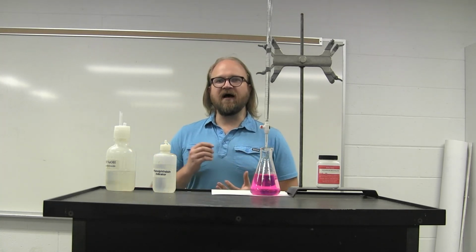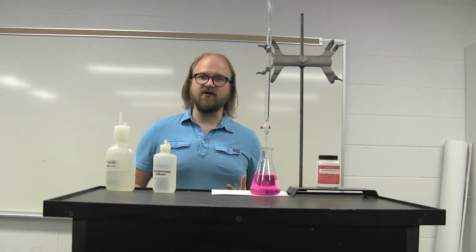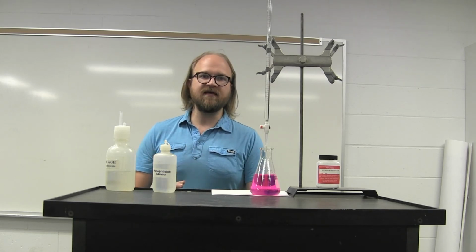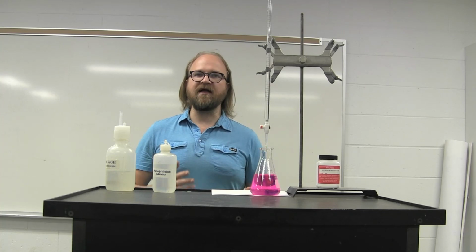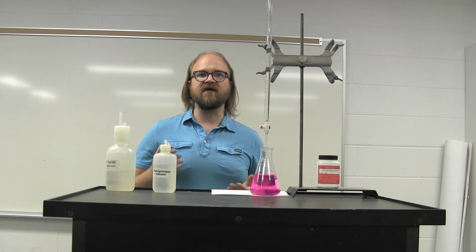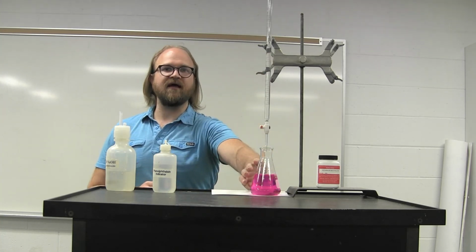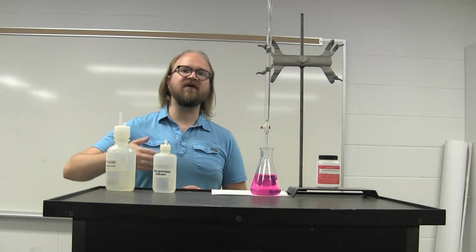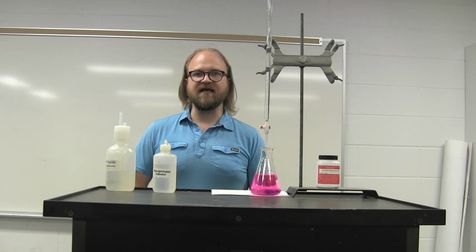In the end, in this experiment, you're performing a number of different titrations, looking at using a titration to solve for an unknown concentration by meticulously adding very precise volumes until the indicator changes color and you have the precise amount where there's a stoichiometric equal amount of titrant and analyte, what's in the flask. You're also going to be doing a titration and preparing a titration curve by measuring the pH after every milliliter of sodium hydroxide is added.